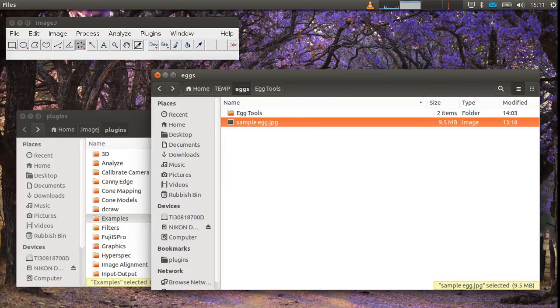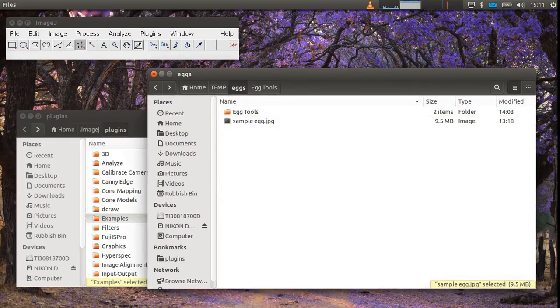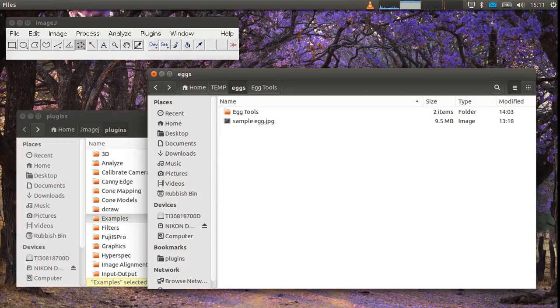Once you download the files, you'll see that there's this folder called eggtools and what you need to do is place this into your ImageJ plugins directory.